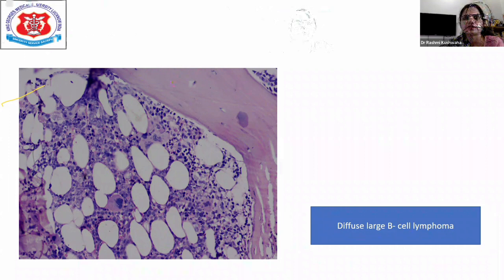This is case 7, a 60-year-old male with bilateral cervical lymphadenopathy and abdominal ascites. In this case, we tried FNAC flow cytometry from the cervical lymph node. Now, whenever we get a patient with lymphadenopathy and the patient is sick, we proceed with FNA flow rather than waiting for the tissue biopsy and IHC, because flow will give a faster result.